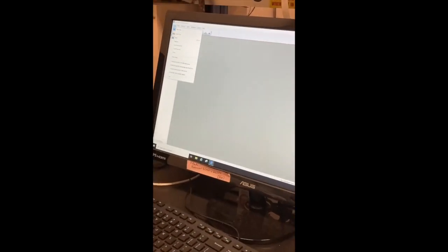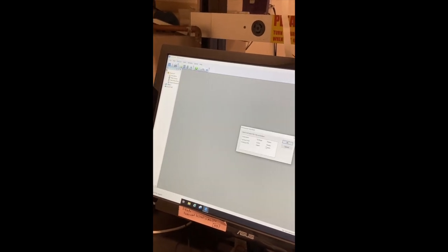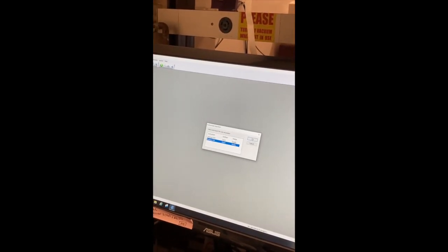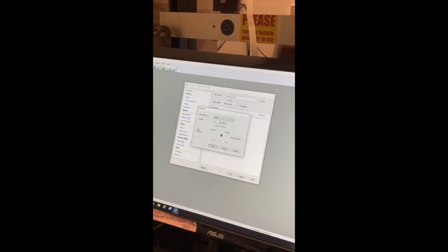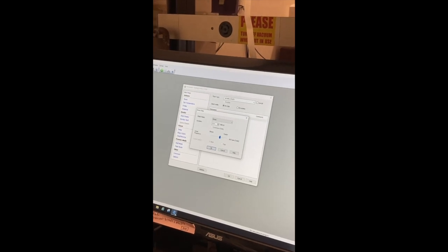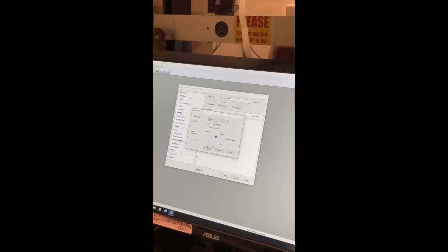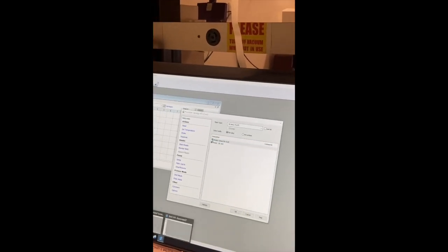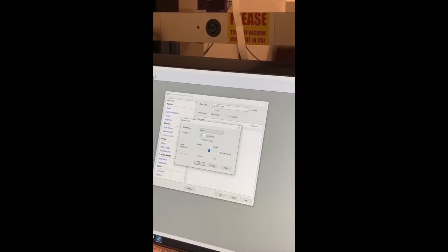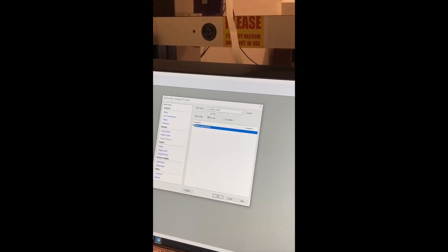Okay, so when you want to make your new protocol, you click New Task, and it'll bring you to this setup. And then you go to Protocol, and you go to Procedure, COM4, and it'll bring you to this. You want to click Shake, and you want to have it for 0.01, which will be 10 seconds, and in a linear mode. You click OK. Oh, JK, you want it to be for 10 seconds. Okay.